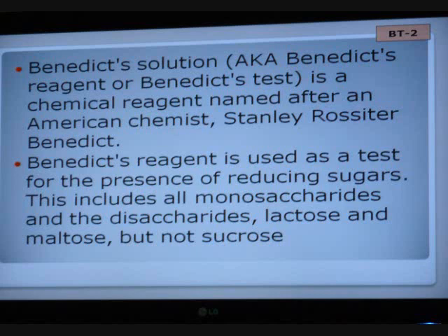But if you were to pour regular sugar in water and make a sucrose solution, it won't find that. You'll think there's no sugar in there, but you know there is. I'll pour them in there.